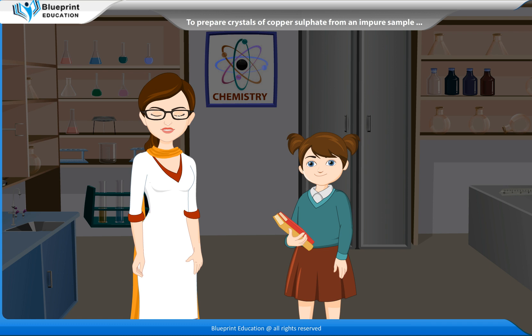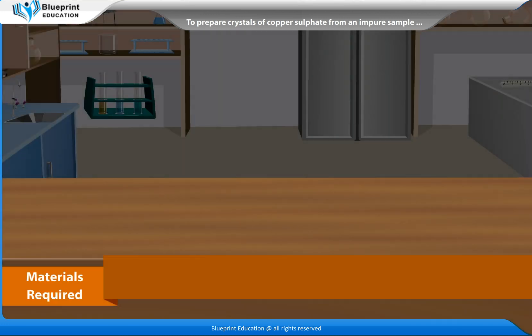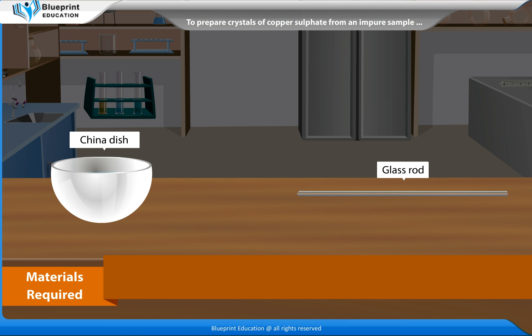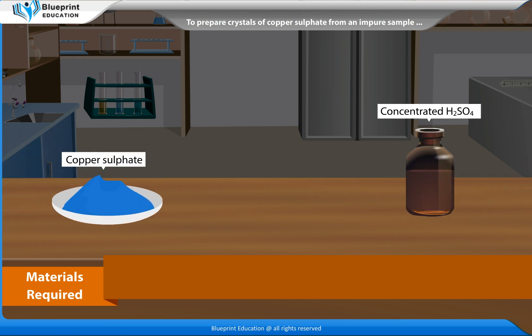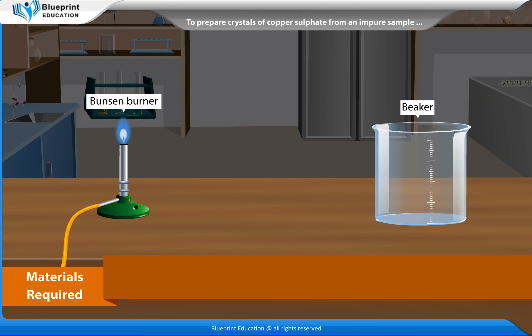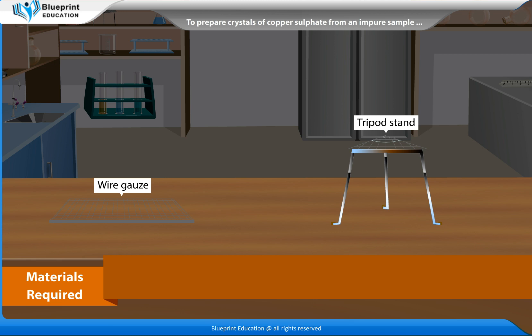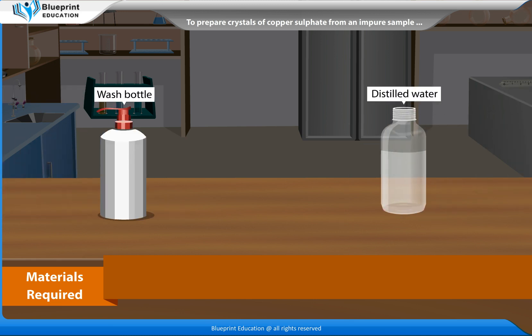Let's perform an experiment to prepare crystals of copper sulphate from an impure sample of copper sulphate solution. The materials required are: China dish, glass rod, an impure copper sulphate sample in powdered form, concentrated sulphuric acid, Bunsen burner, 250 ml beaker, wire gauze, tripod stand, wash bottle, and distilled water.